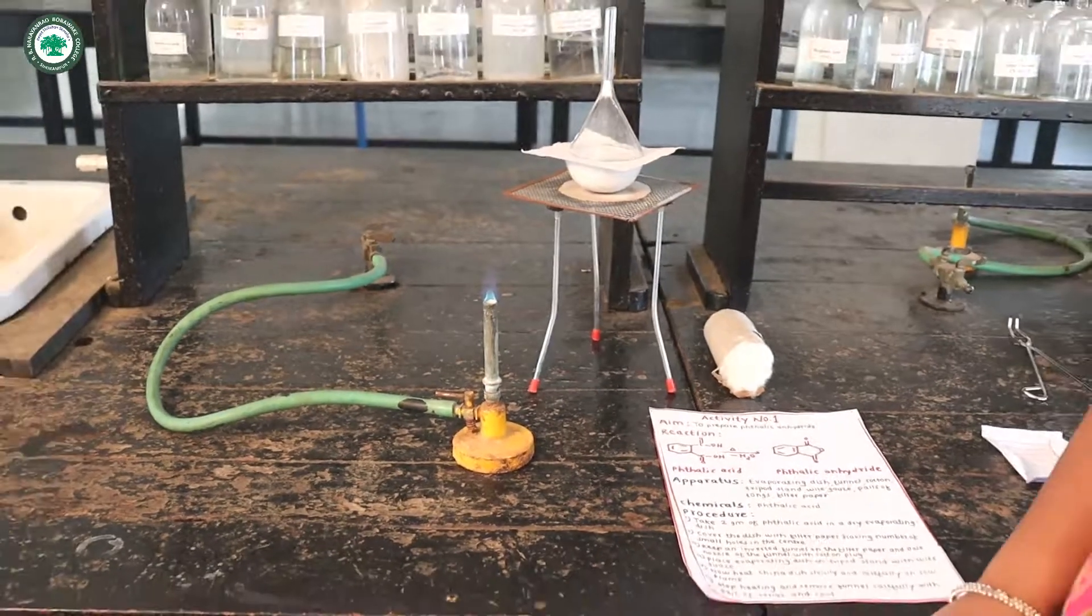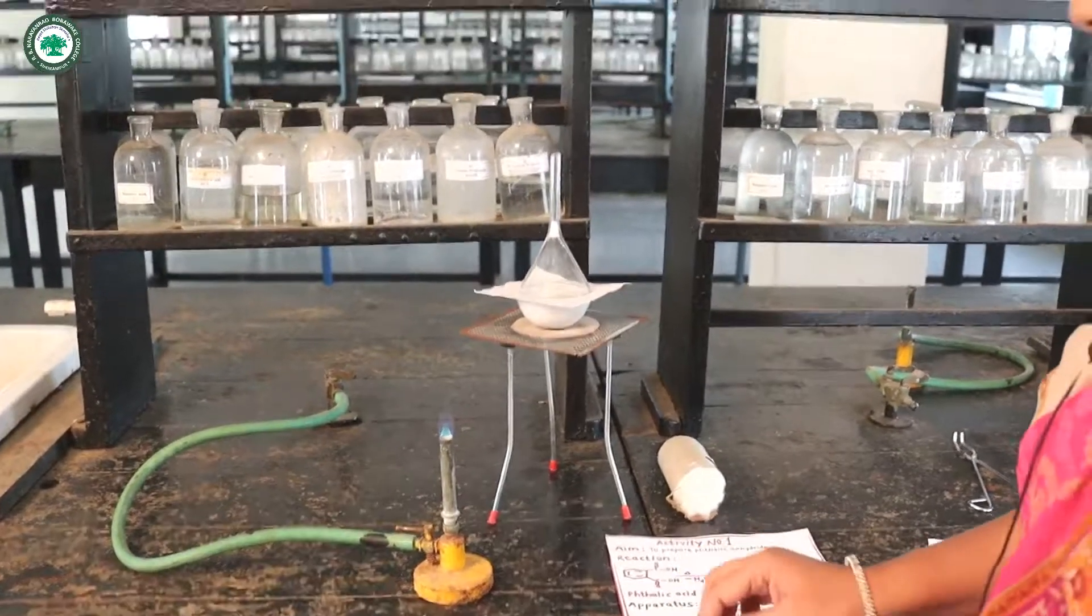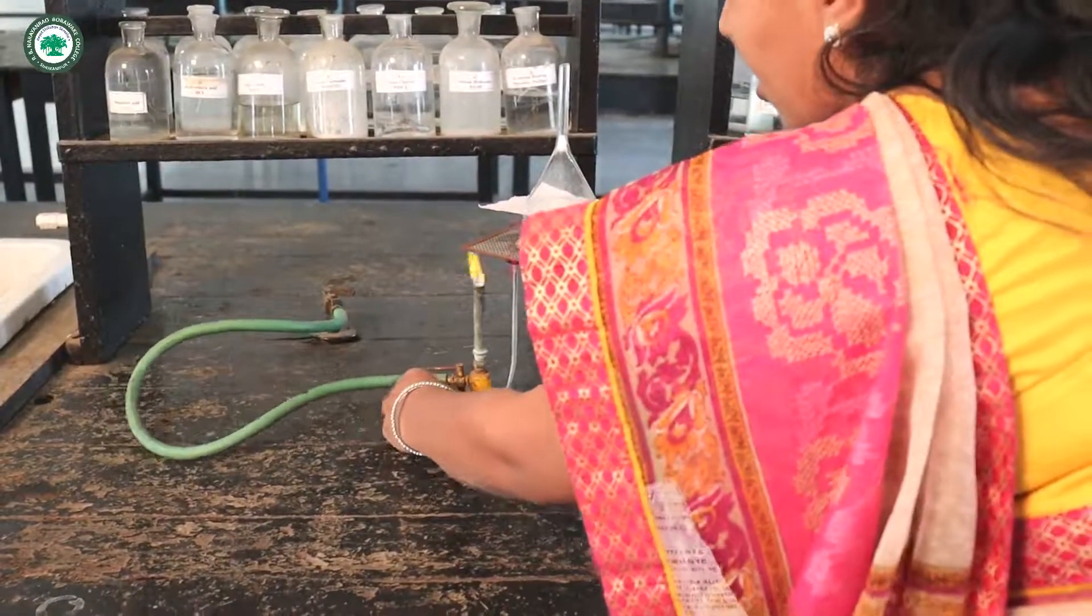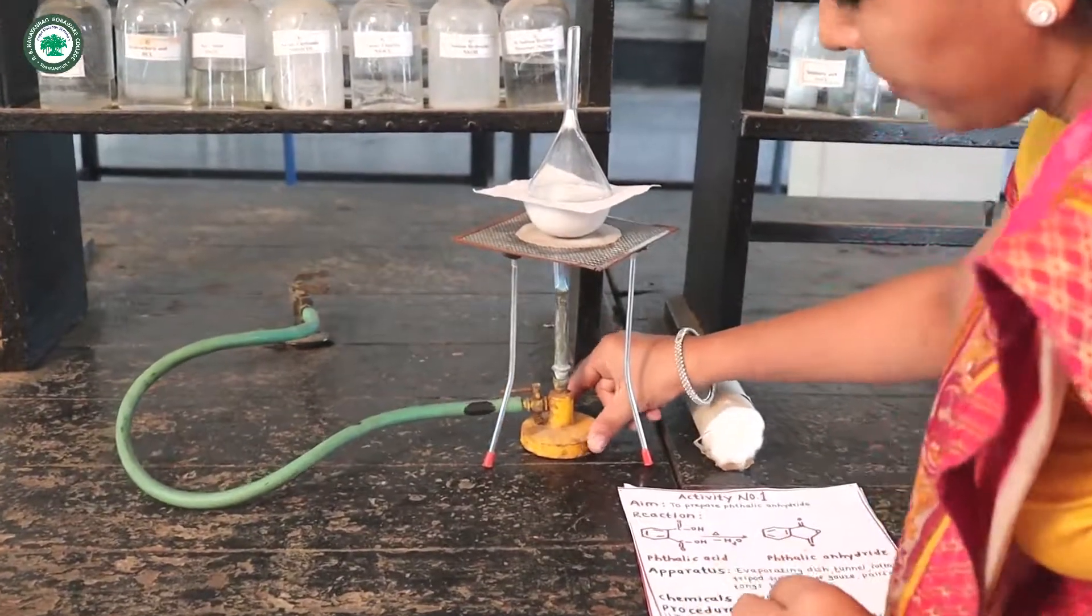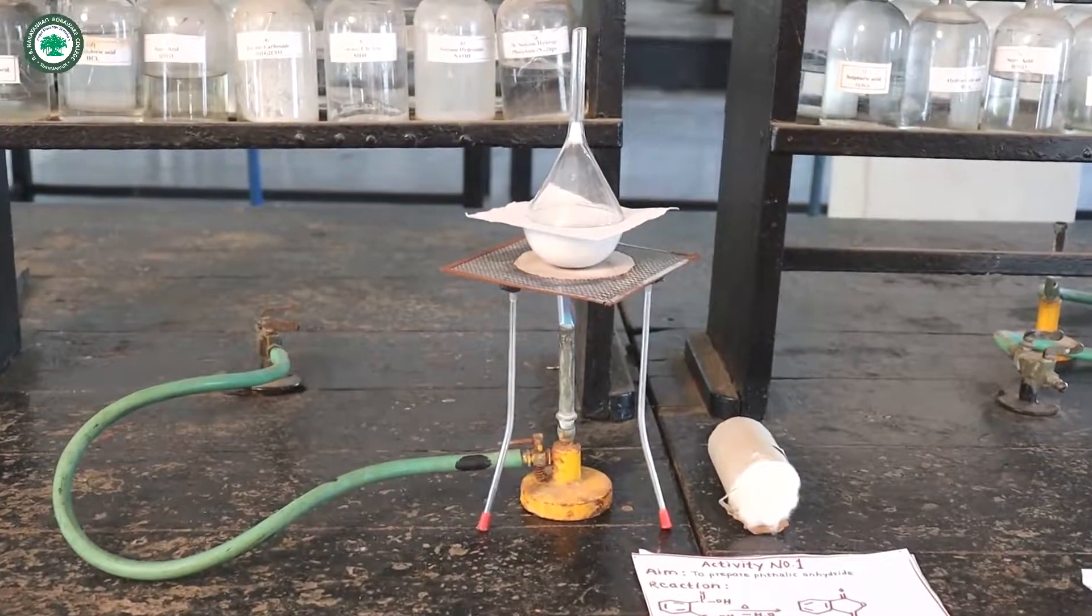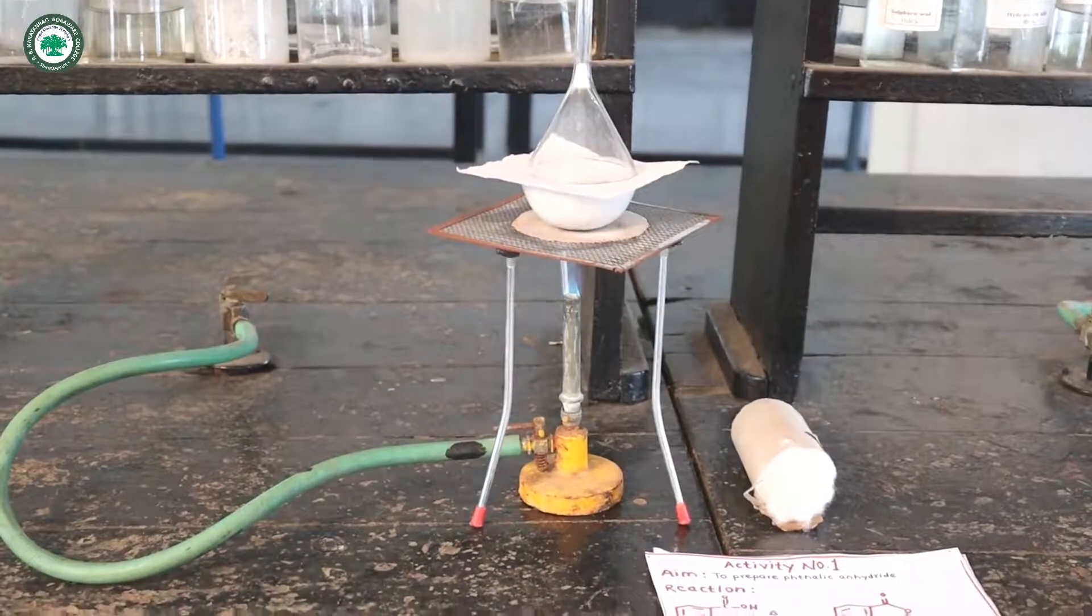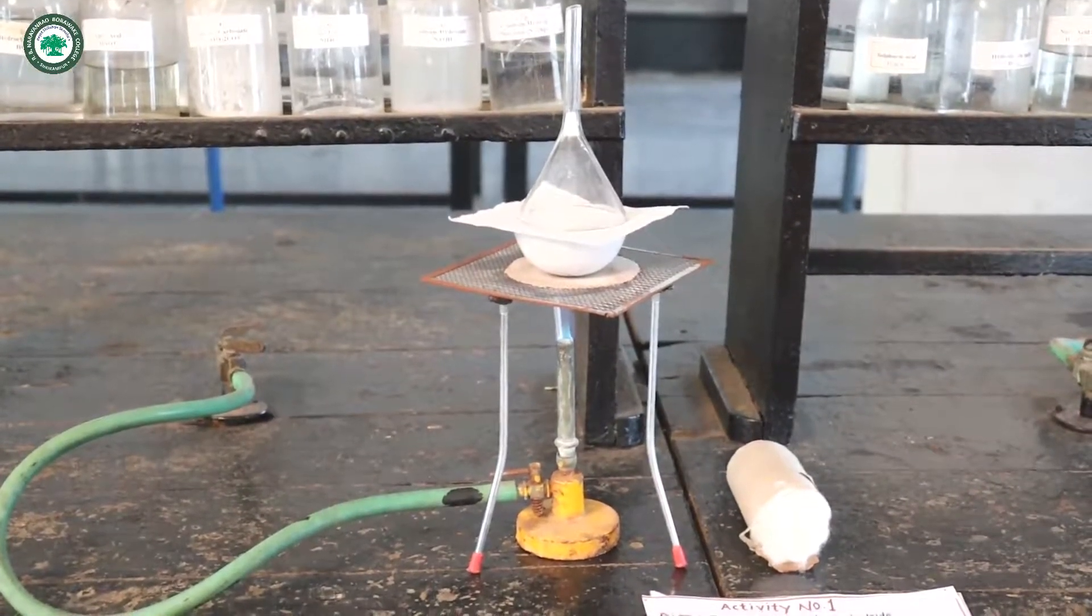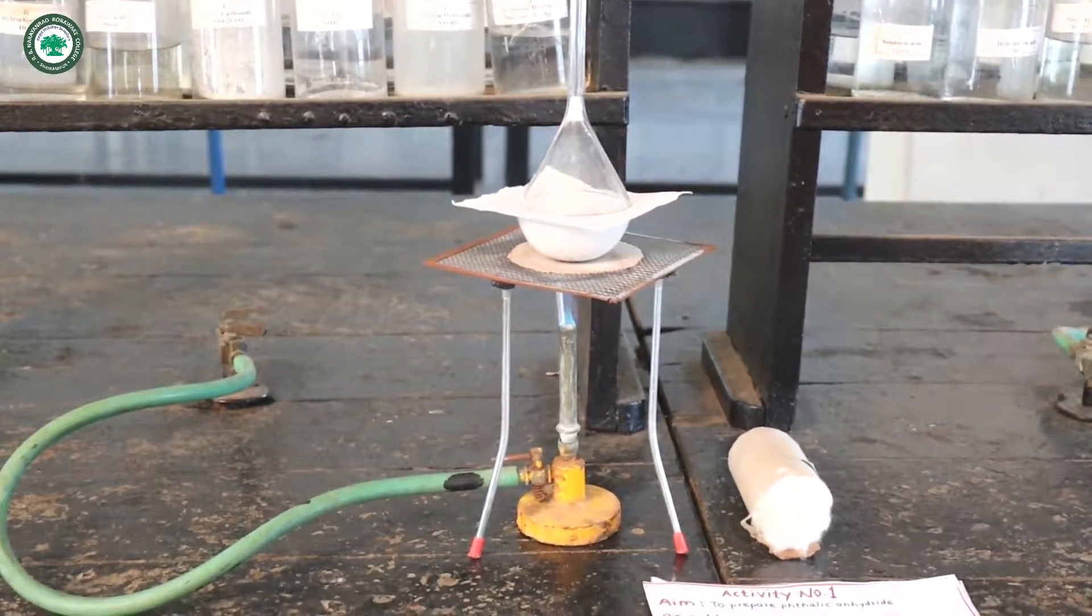Then now heat the evaporating dish very slowly. It must be noted that flame should be very slow so as to avoid decomposition of phthalic acid.